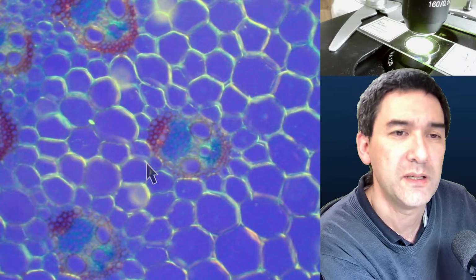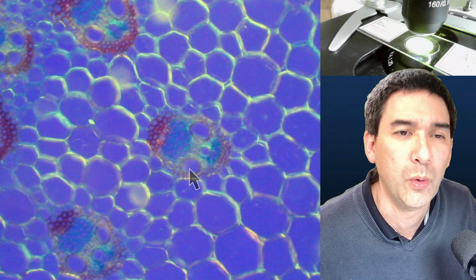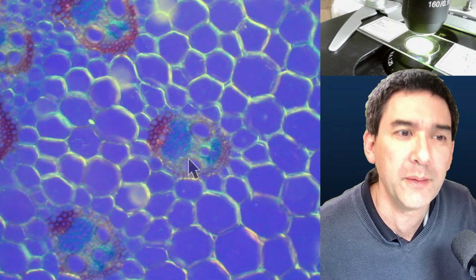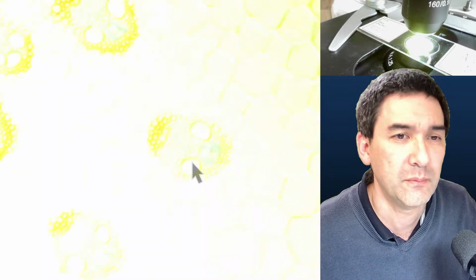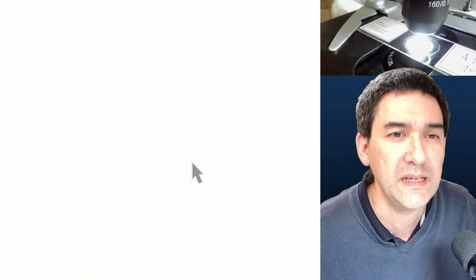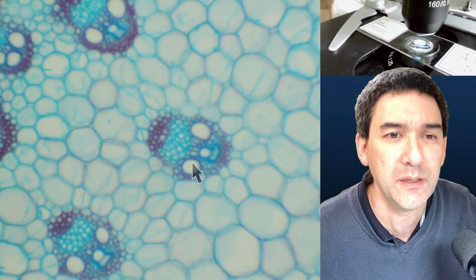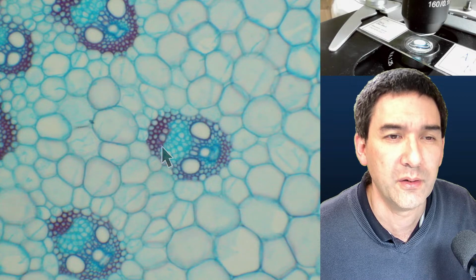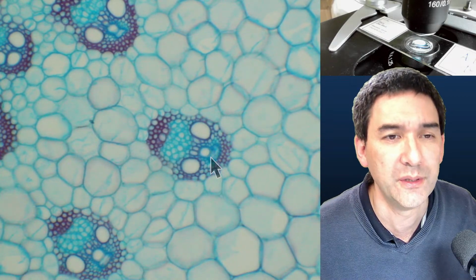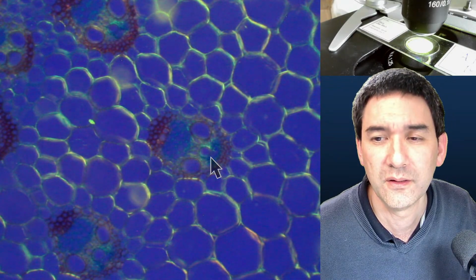So these things are so-called vascular bundles, where water is transported up the maize plant, corn, maize. Yeah? And this is how it looks natively. It's a stained specimen, that's why there are blue colors and red colors and so on. And that is now with the filter added. Okay.